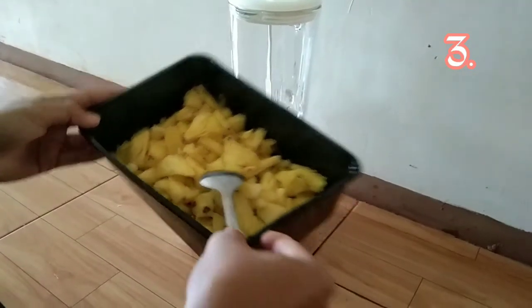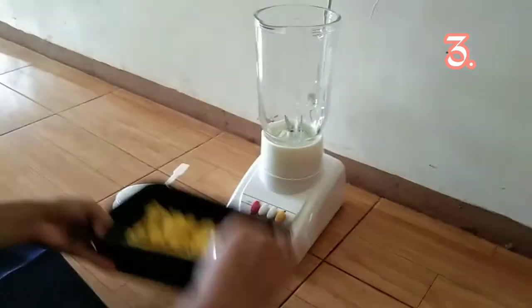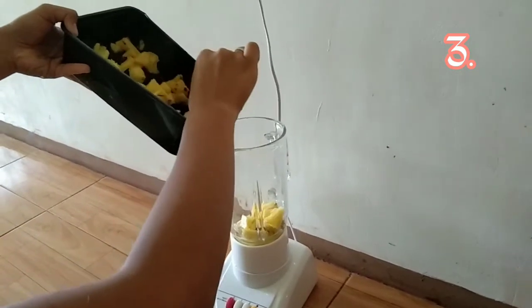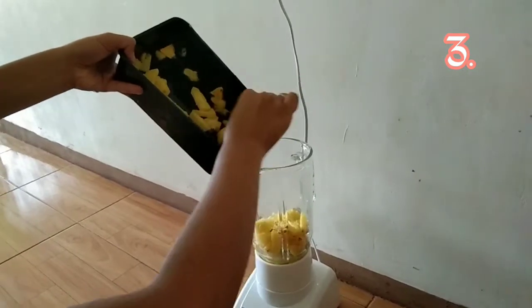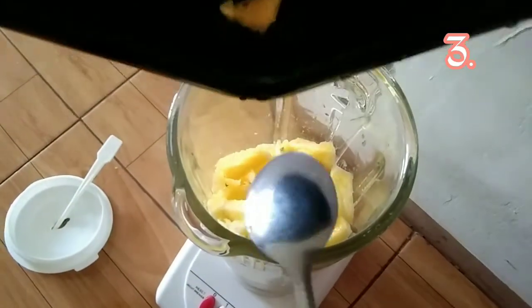We will now blend that washed pineapple in a blender. Let's pour that together and blend them.